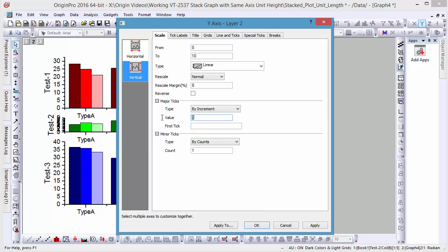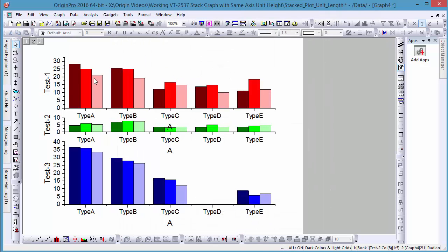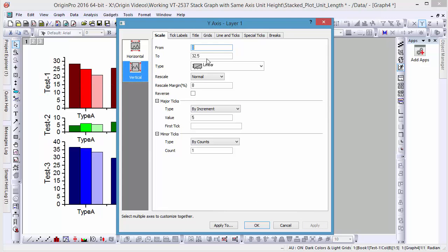If we look at the y-axis of the top graph, you'll see that the maximum value ends between the major tick marks. For consistency, let's double-click on this graph and set the maximum value to 35.